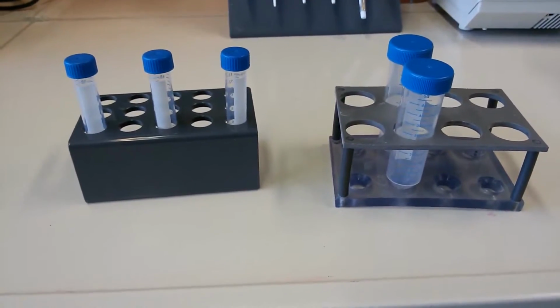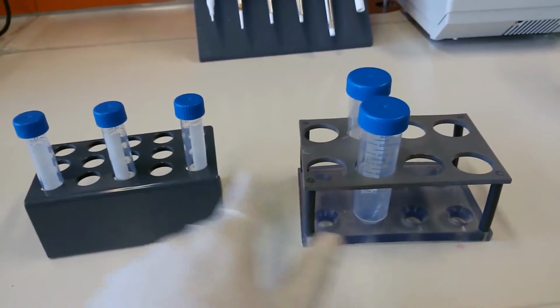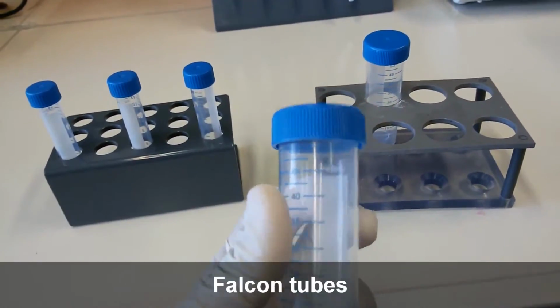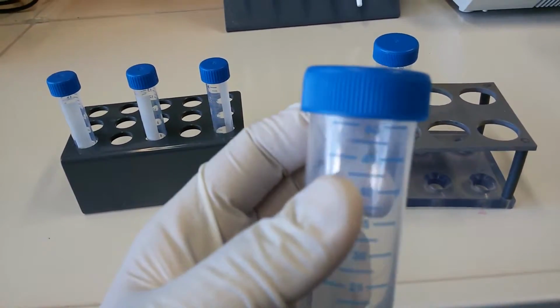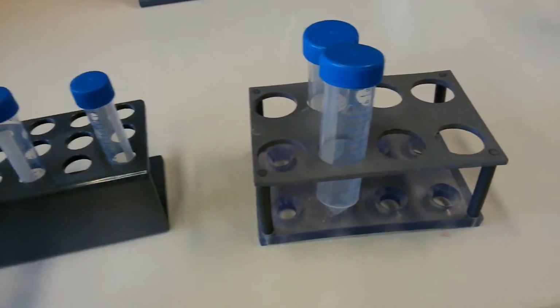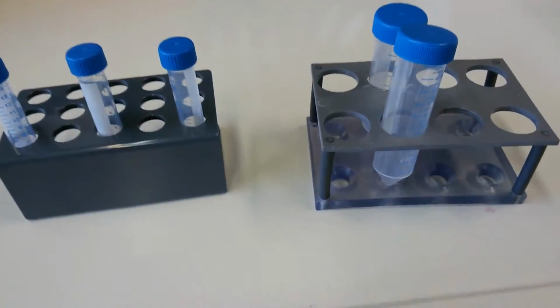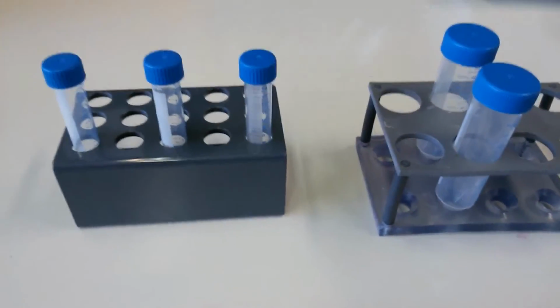Okay, so now I will introduce you to two different things. Here you can see two stands. We call them Falcon stands, and we call these tubes Falcon tubes. Again you can see it's written 50 ml. So this is 50 ml, and these are 15 ml. This is 15, this is 50, and we call these stands Falcon stands.